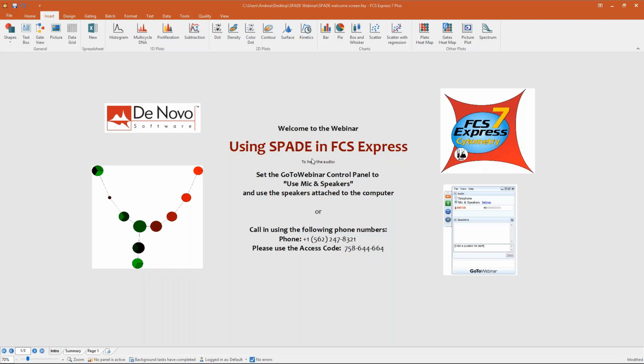And just to conclude, because this is a great question, there are people that, for example, run t-SNE and SPADE in parallel, and they use t-SNE just to visualize the clustering, to double check that SPADE performed well. And there are also other people, and this is an interesting approach, that do not really run SPADE on the data set. They run SPADE on t-SNE. So they use SPADE to cluster the results generated by t-SNE. So you see, it's a really interesting topic.